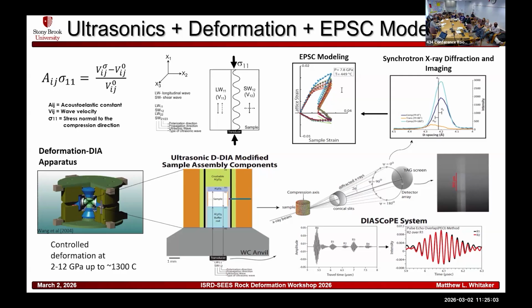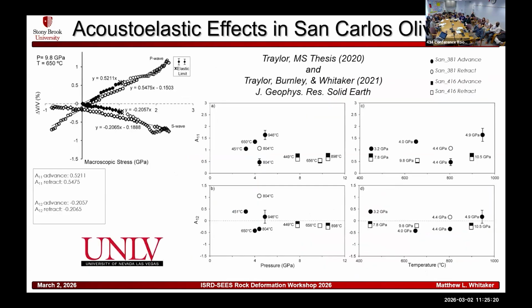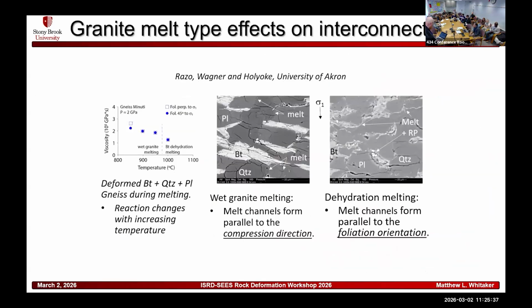The compressional direction is going to be your detector 1 vertically, and your transverse direction is going to be detector 5 horizontally. You can see they're in very different places as far as where the centroid of their peaks are. So she was able to find that there is a significant difference in the P waves that starts before you can actually start to see the deformation of the sample. The shear waves seem to remain pretty consistent the whole way through. But again, there will be probably more information on that tomorrow.